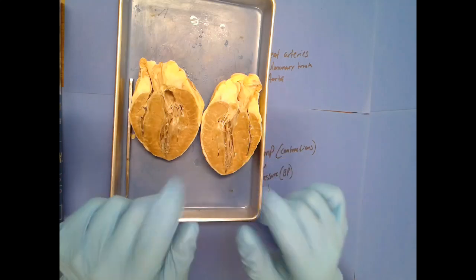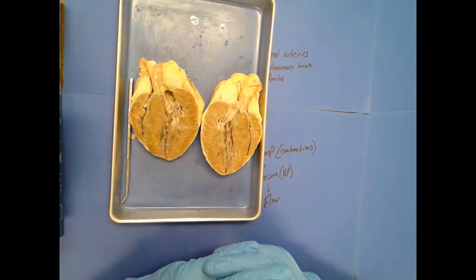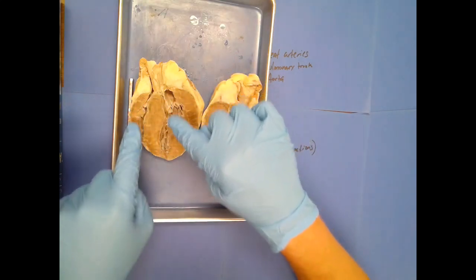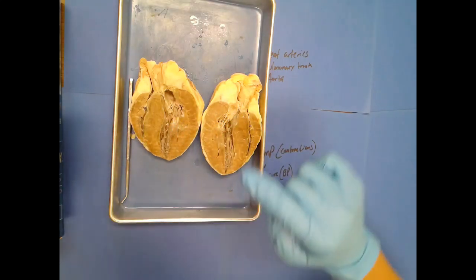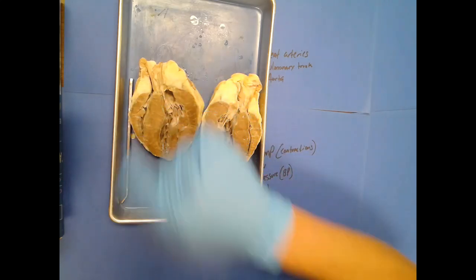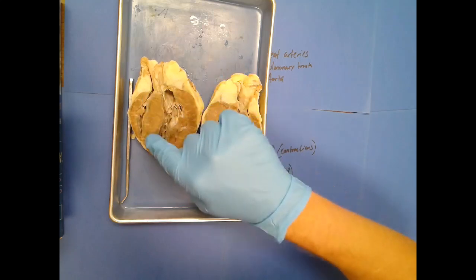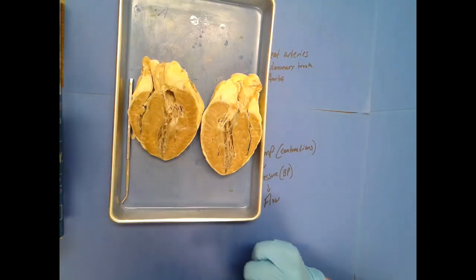All right. So this is the IV septum, and the hollow area on each side of it are the ventricles. Now, what you want to do is look at the lateral wall of each ventricle. Because again, this is the IV septum, and these are the lateral walls of each ventricle. You'll notice there is a discernible difference in thickness between one side or the other.